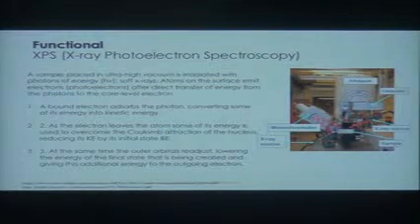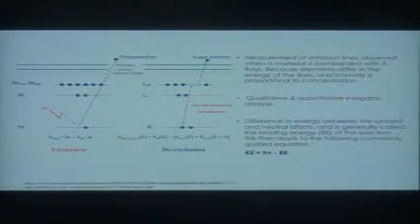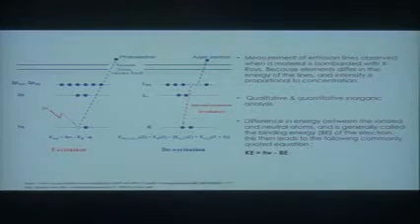Again, the hardware is rather complicated, but just to give you an idea of what I just said, you have these electronic states. Typically they'd be hybridized in a solid state material, and you have an electron that comes out. The photoelectron that comes out is going to have a certain energy that you would measure, and then that energy alone is not enough.